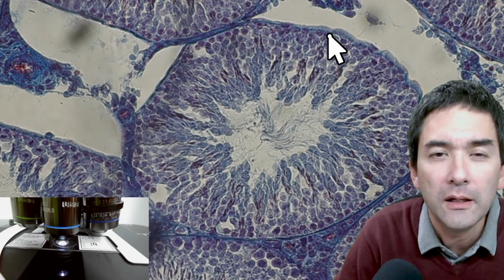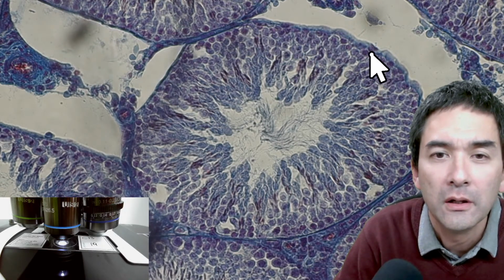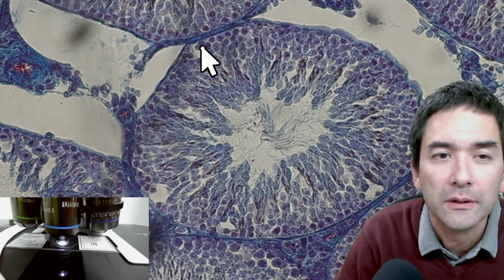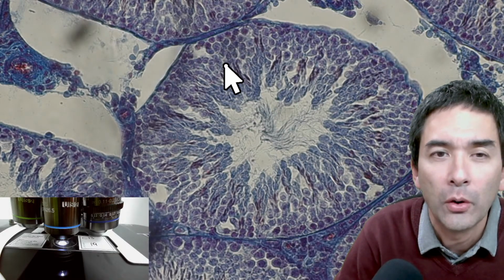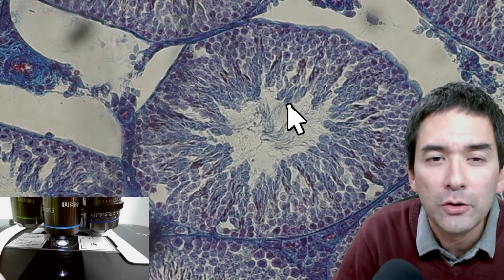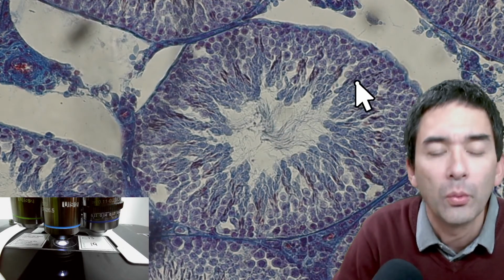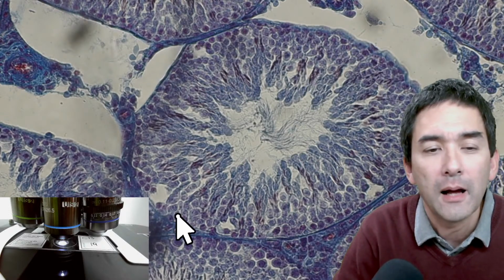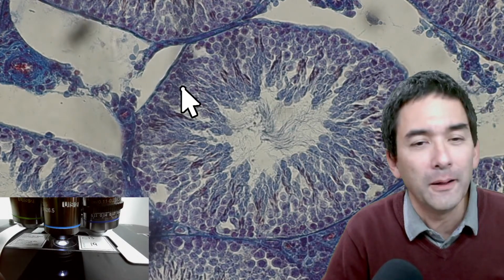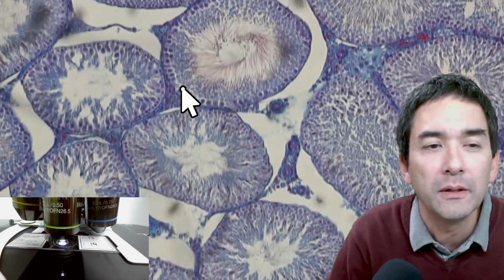Yeah? So essentially, the sperm cells start off being made here in the wall of the seminiferous tubule. Yeah? And the cells divide, they undergo a process that we call meiosis. And then from one cell that you have here, from the germinal epithelium, at the end you make 4 sperm cells, and those sperm cells, or spermatozoa, are then found in here, and then they're transported away. Yeah? So I personally like the cross section of the testes as a microscopic specimen quite a lot because it looks kind of good.